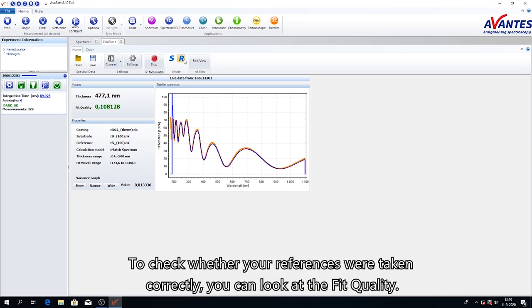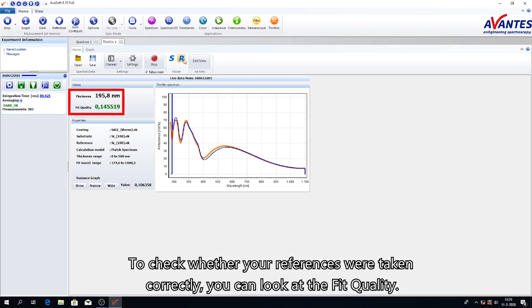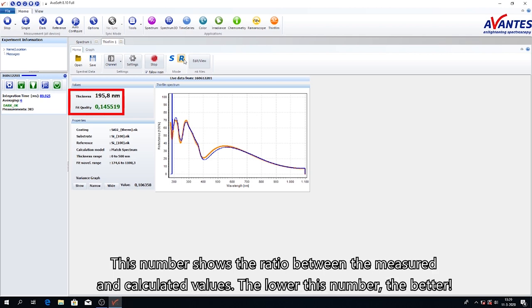Check whether your references were taken correctly. You can look at the fit quality. This number shows the ratio between the measured and calculated values. The lower this number, the better.